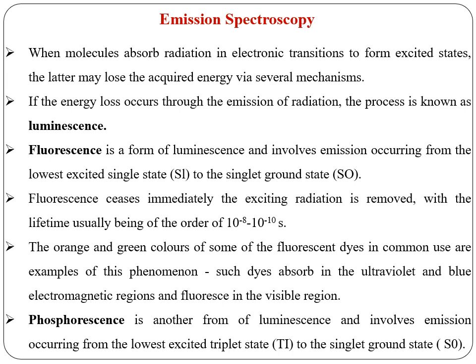Fluorescence is a form of luminescence and it involves emission occurring from the lowest excited singlet state to the singlet ground state. The fluorescence ceases immediately when the exciting radiation is removed, with the lifetime usually being of the order of 10 raised to minus 8 to 10 raised to minus 10 seconds.